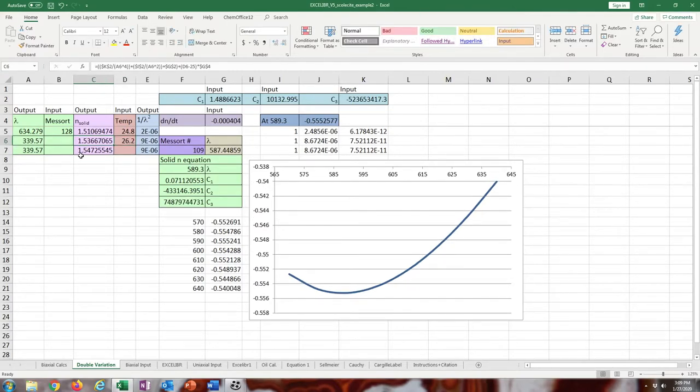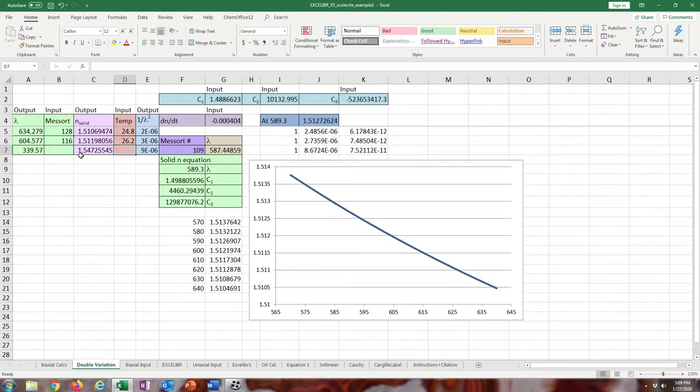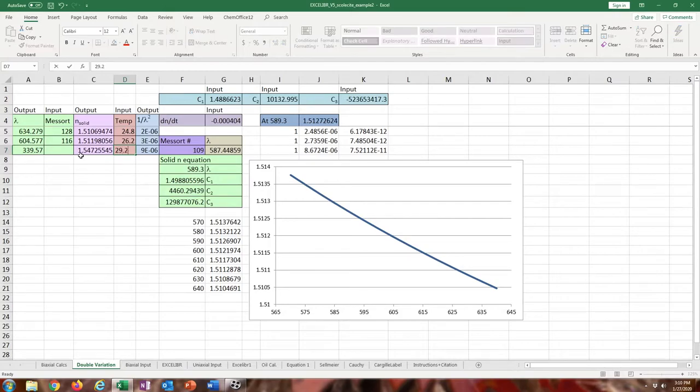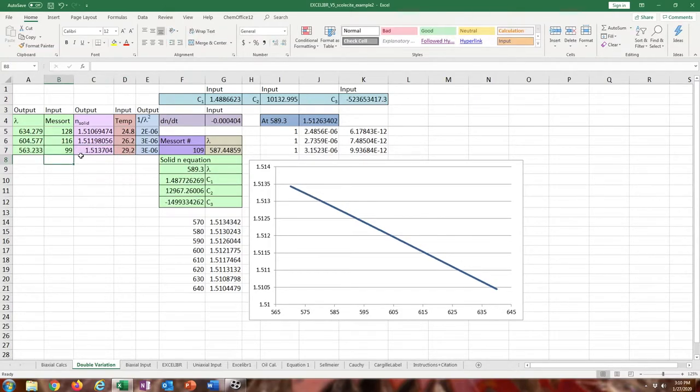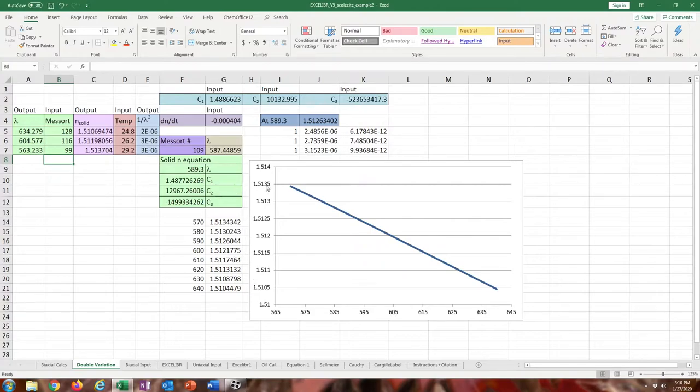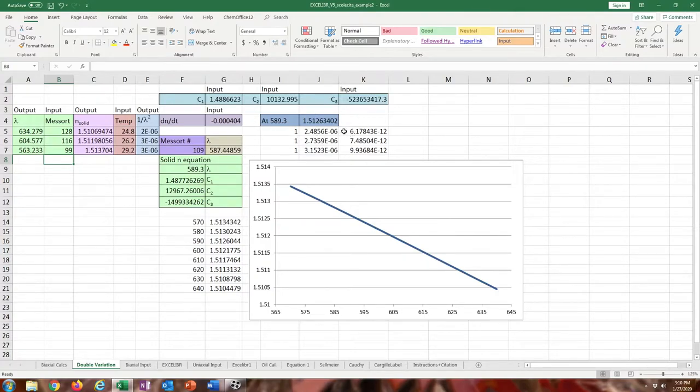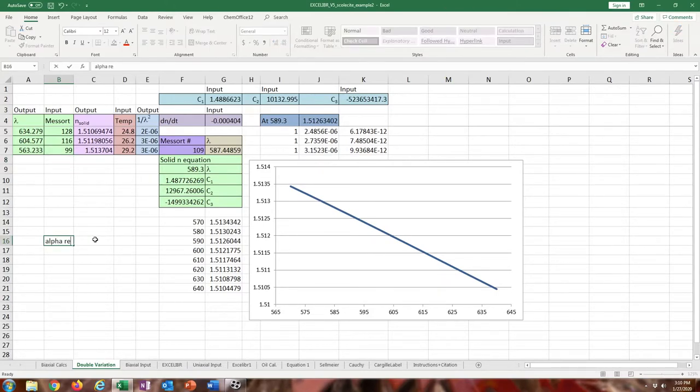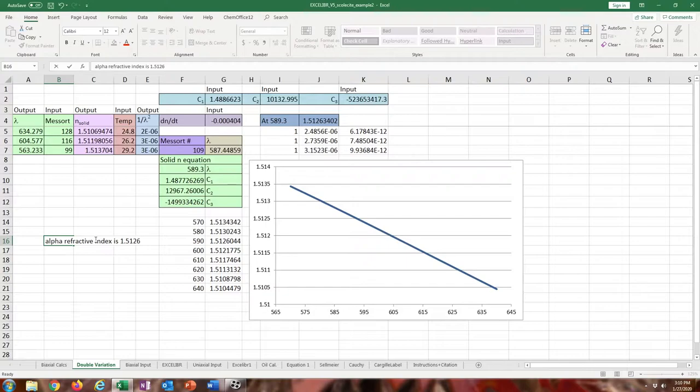As long as the dndt and the Cauchy constants are right, you can make these entries. You can change this also if you want to include more entries, but I just made it into three, like a square matrix. Then it'll output in that dark blue at 589.3 what the refractive index is. The corrected refractive index of the crystal. So alpha refractive index is that. That's our first measurement.